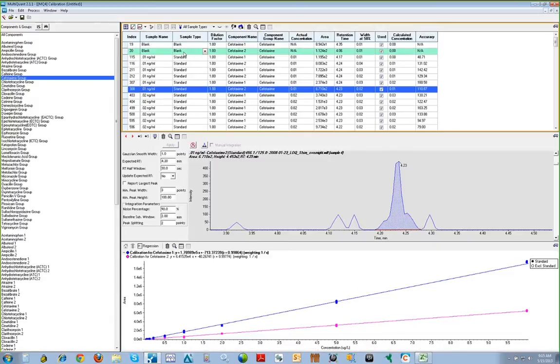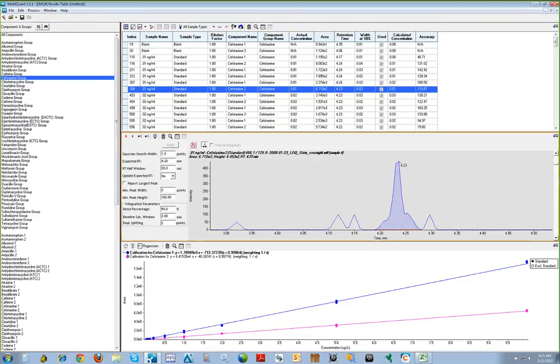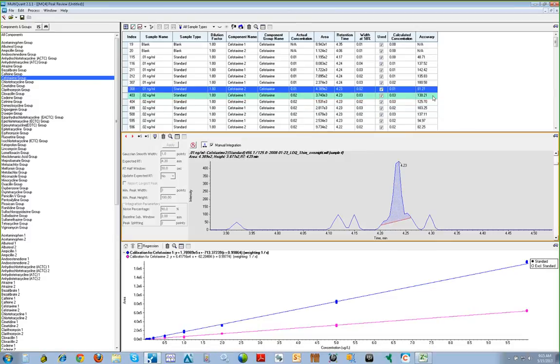It should also be noted that updates to the results table are totally dynamic. If we make a change to the integration of a peak, the calibration curve and results table are updated automatically.